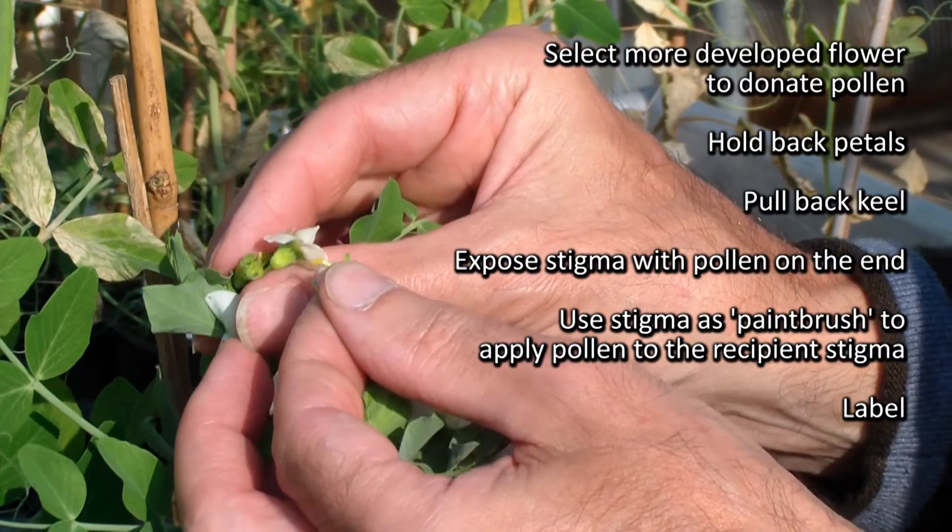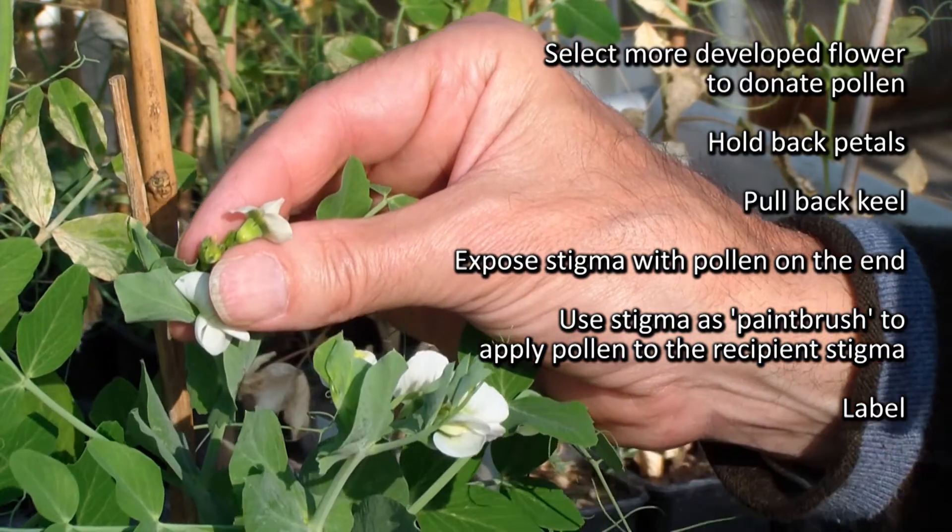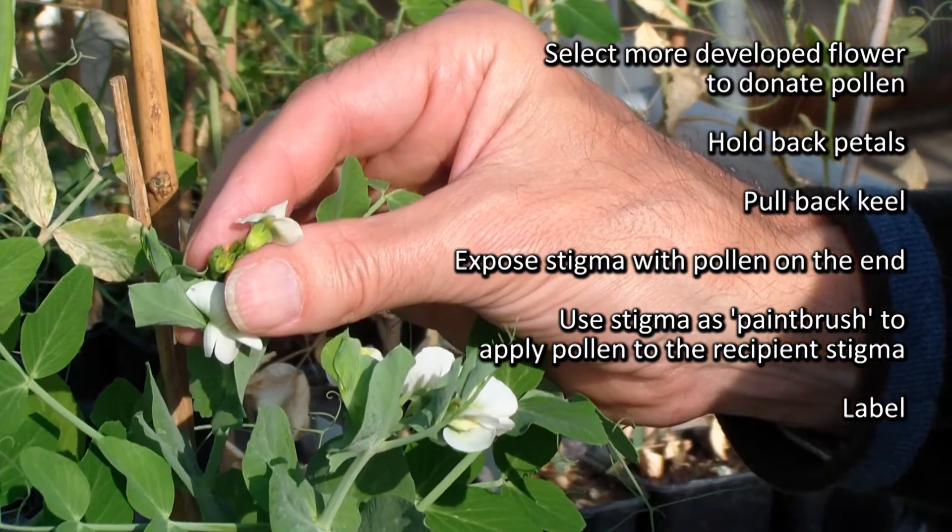We can use this as a paintbrush to apply the pollen from this flower onto the recipient style. It's nice and visible — you can see the yellow pollen. So that is now ready to be labelled up.